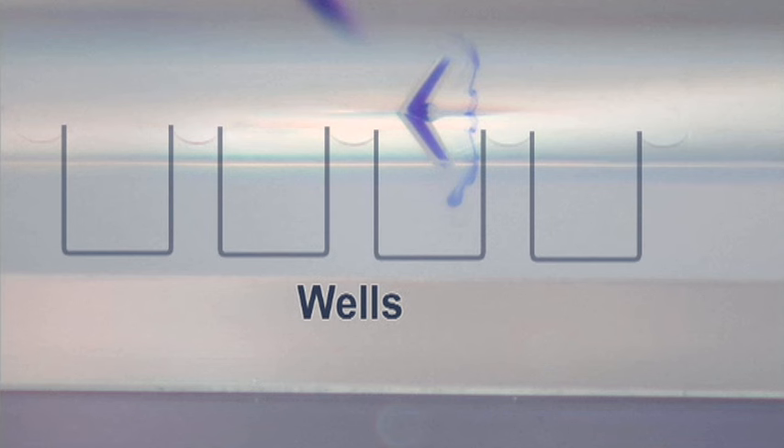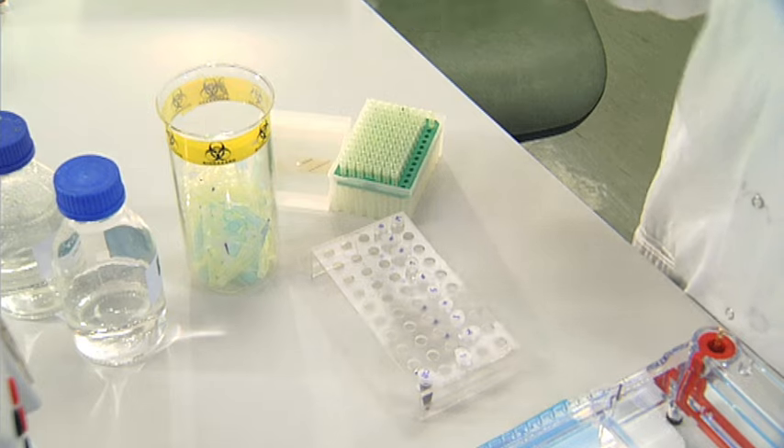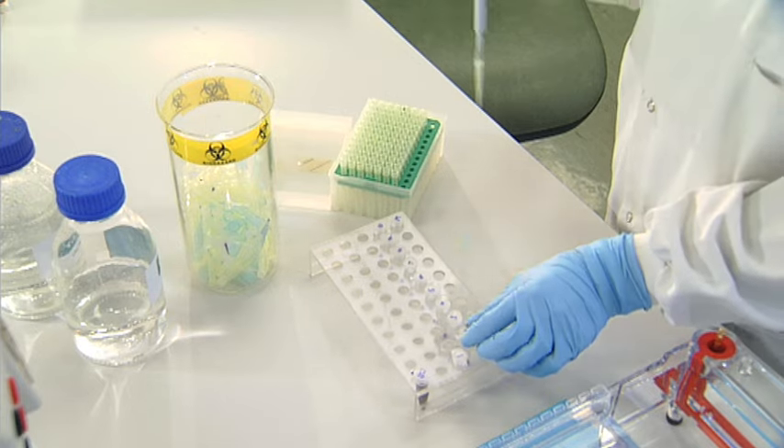The tip of your pipette should be just inside or just above the well, but not touching either side or the bottom of the well. Slowly and gently load the sample into the gel, being careful not to blow air into the well once the sample has been expelled. Each time a new sample is loaded, use a new tip.